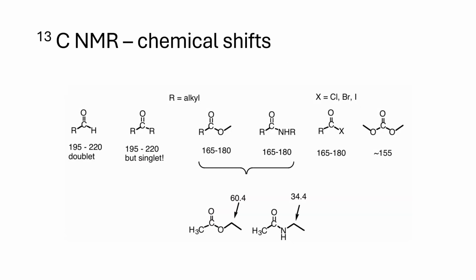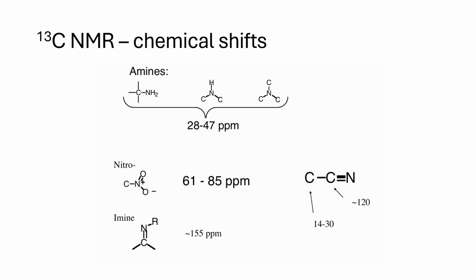This is more like that here, carbonyls. All of those are carbonyls. And notice this is more deshielded due to the electron withdrawing effect. Oxygen is more electronegative than nitrogen. That's what you will see here.